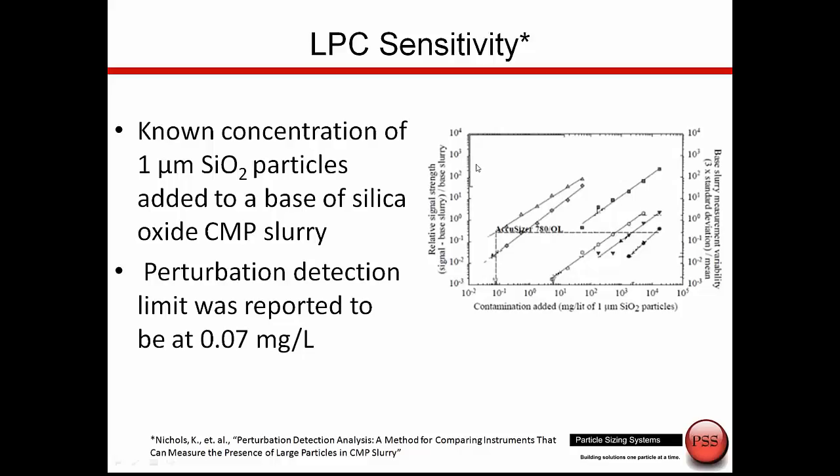So what they do is they'd measure the sample, and then they'd measure the sample plus the spike and look at the difference. And what you see, this graph on the farthest left is the AccuSizer. This was an online AccuSizer. And they compared it to these other vendors, and I'm always polite, and so I'm only showing the AccuSizer data, and I removed the names of the other vendors. But one thing I'm going to say here is the data from the AccuSizer, and this one you see over here is squares, is actually a laser diffraction analyzer, and one I'm fairly familiar with.